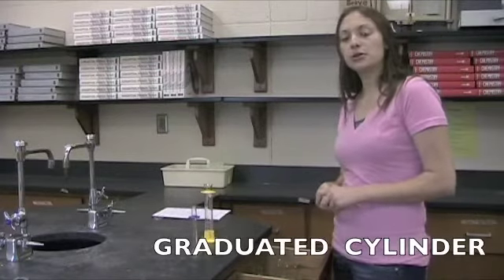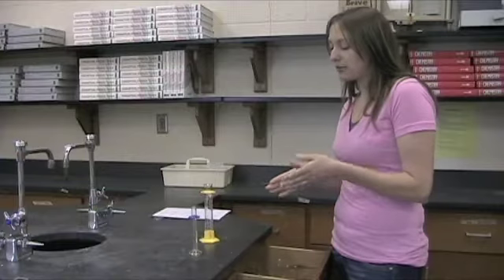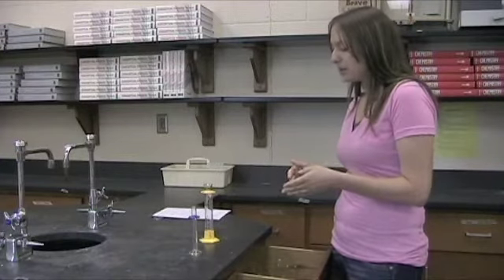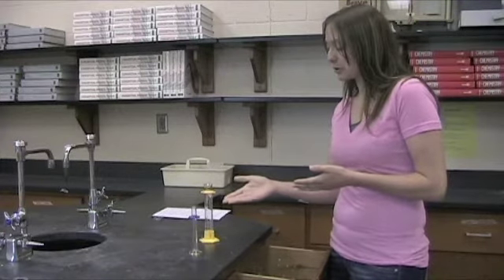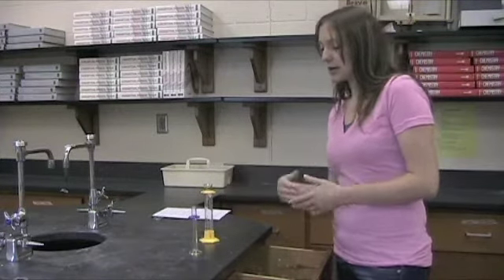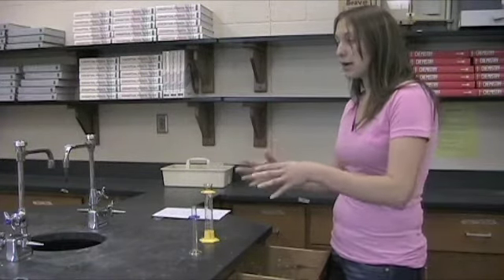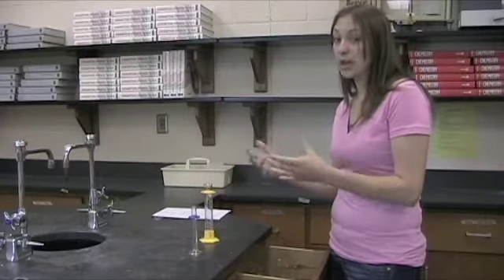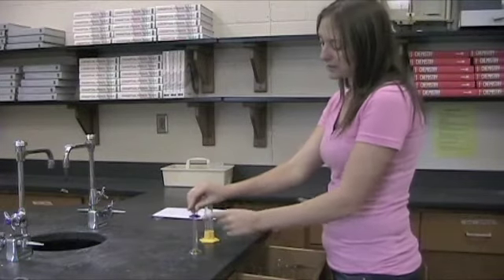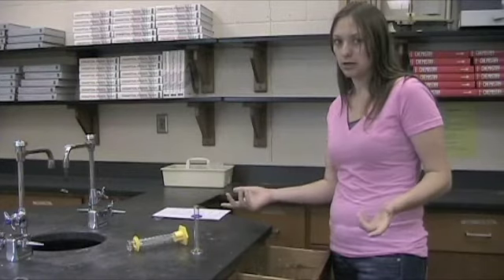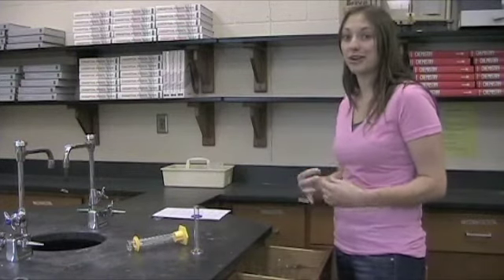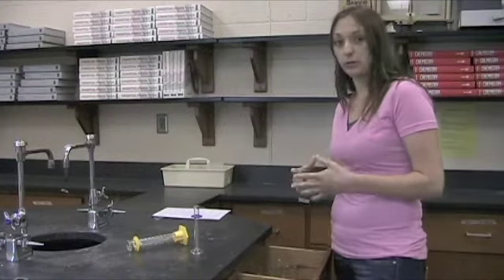Graduated cylinders. Graduated cylinders that you're going to have come in two different sizes. They have different scales on them, so you've got to be careful. This one goes from 35 to 40. This one might go from two to three. So, you have to be very careful when you're reading these that you're using the right scale and then you are guessing correctly as to what your volume. Graduated cylinders often have these little guards on top. That's for if I accidentally knock it over, you don't break it. So, if yours does not have a guard on top, be extra careful. If you do knock it over, it will break.